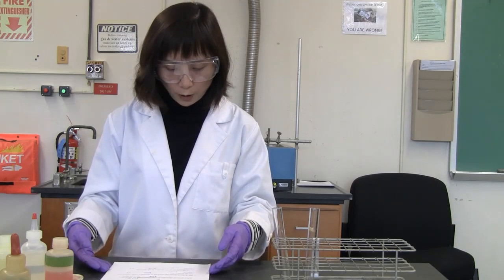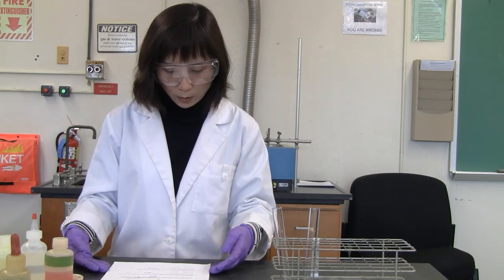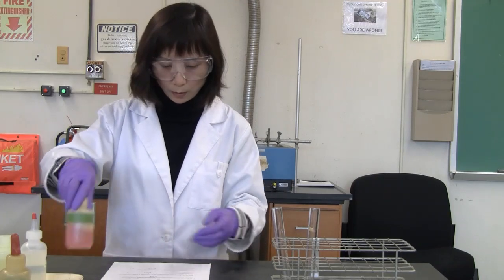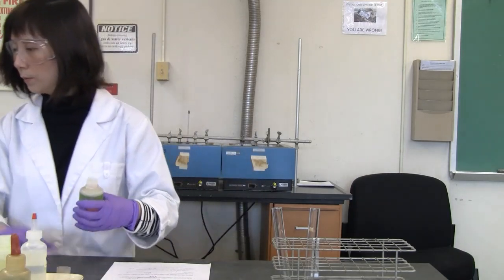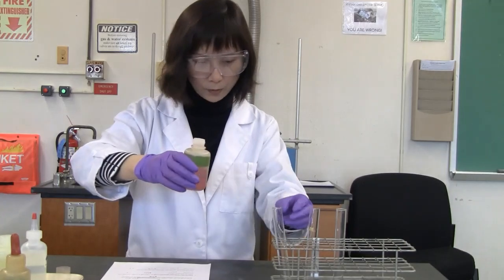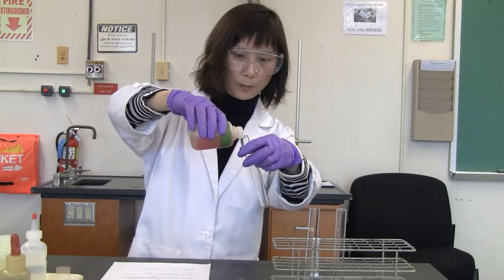So I'm going to follow the guidance to prepare the solution. So it says 2 milliliter of cobalt chloride into each of the 3 test tubes. 3 test tubes. All right, 2 milliliter. It's going to be 2.